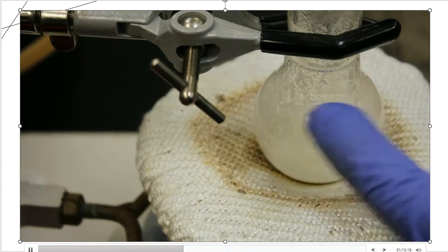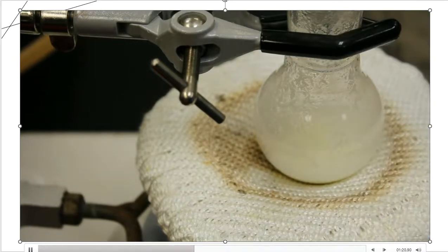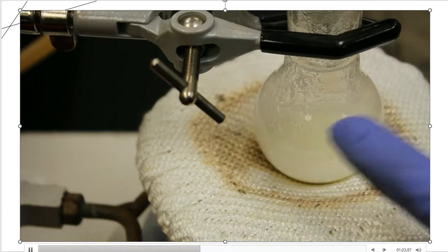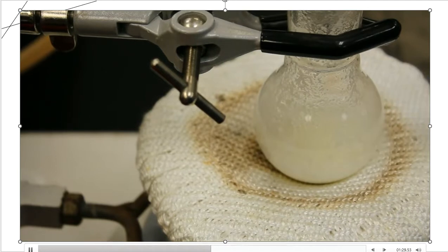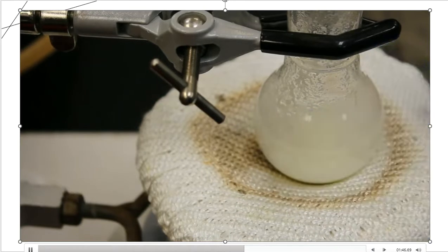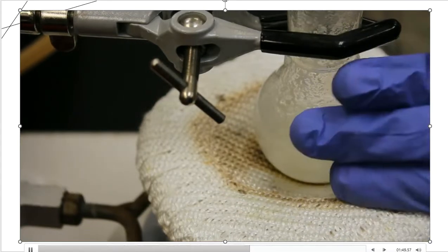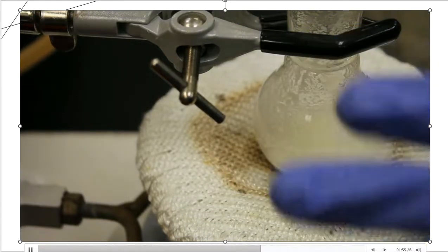So some of the observations that you can make note of in the boiling flask: it's still milky, still creamy, not as foamy as it was when it was reacting, but I also see some crystals forming here on the outside of the flask. So once again, that's another good sign. It might be some of the aluminum chloride that hasn't reacted and is just left over, or it could actually be product. It could be either or, but that's going to be part of the next step. The water is going to help me decompose all of that remaining aluminum chloride that might be left over. Remember, in the beginning, we flamed all of this, and that way we could get rid of all of the water vapor or water droplets that might be behind.